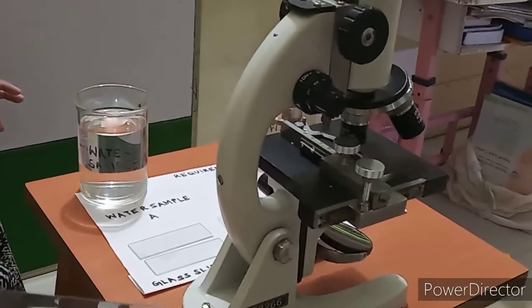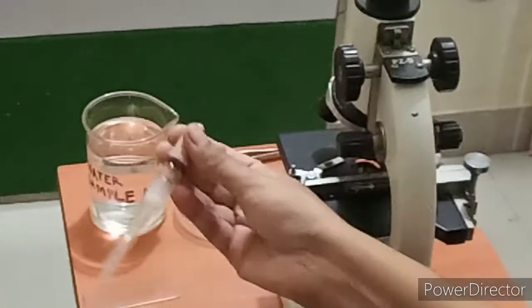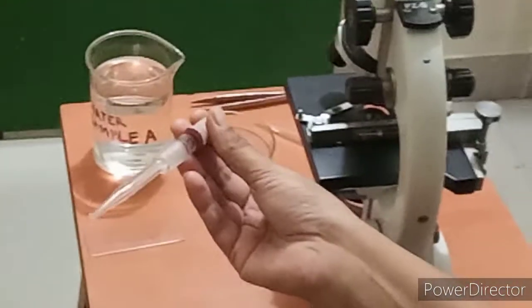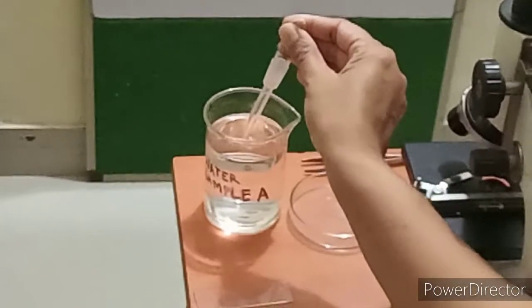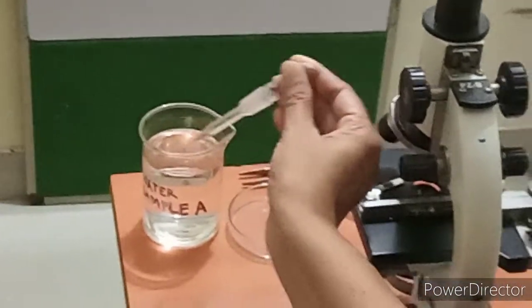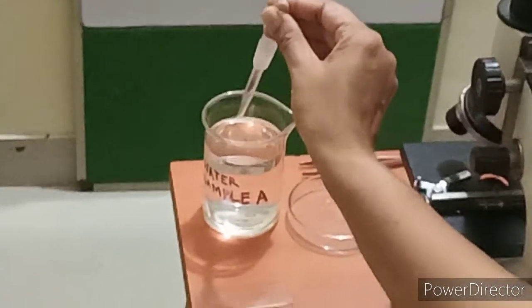Now, how are we going to perform the experiment? Let us do that. First of all, we are going to prepare the slide for sample A. You have to be very careful, children. We have to use separate droppers for different water samples. So this is for sample A. We will dip it in the water sample and take only one drop of this water sample and place it over the slide. Remove the excess of water.